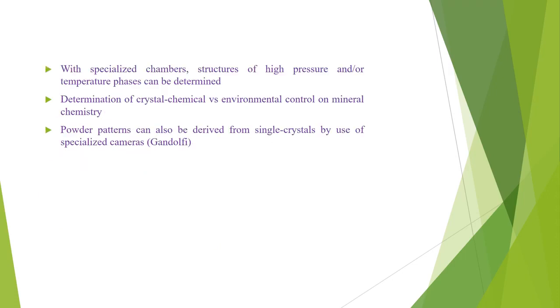Dear student, there are some other applications of single crystal X-ray diffraction technique. By using this technique, if we have some specialized chambers, the structure of high pressure and or low temperature phases can be determined. And also the determination of the crystal chemical versus environmental control on the mineral chemistry can also be studied by using this technique. And the powder patterns can also be derived from single crystals by the use of specialized cameras. These cameras are known as Gandolfi or similar cameras.